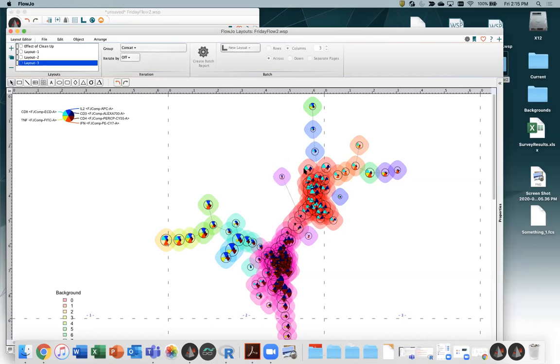CD8 positive, CD3s. So there's our 8s that weren't doing a whole lot, are the two main populations. Again, making sense since 3 of the files were totally unstimulated, 3 of them were minimally stimulated. And I bet what we would see was that a lot of these more edge populations came from our PMA stimulated files, which we could check.